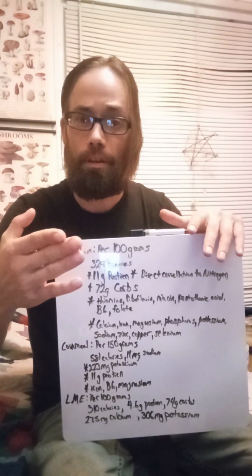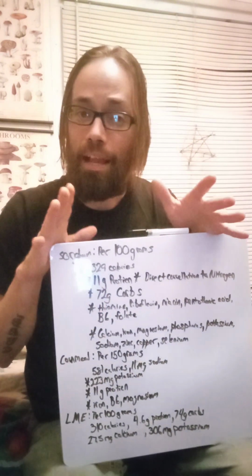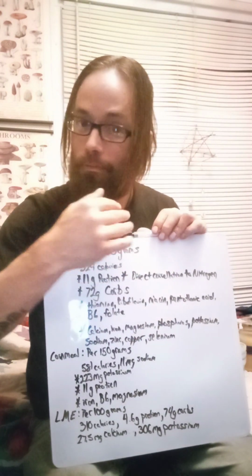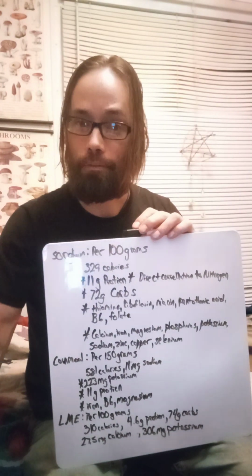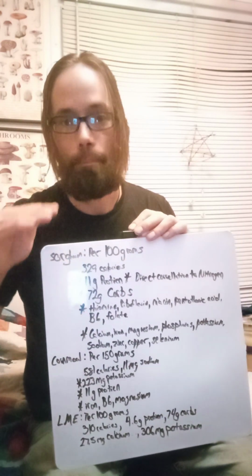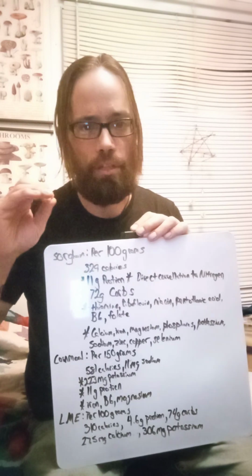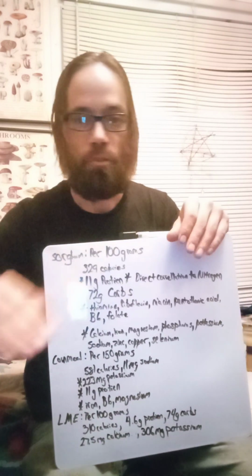Well, I thought, being as they went bad like that twice in a row, and that many of them, there has to be something going on. So I ended up pouring agar all day to try to figure this out. I took another sleeve of plates out of that same box, and I made just basic potato dextrose agar, with a little yeast. Often when I do PDA, I always add a little yeast. Same thing with oatmeal. I always add just 1 gram of nutritional yeast. But I poured them, no problem.